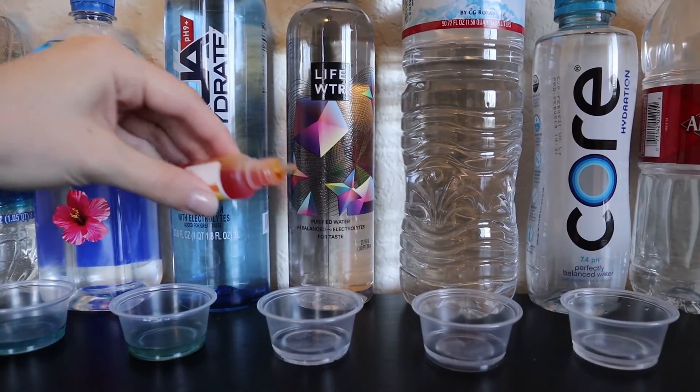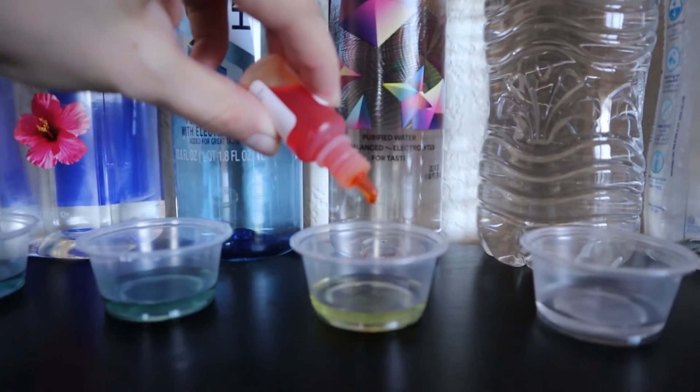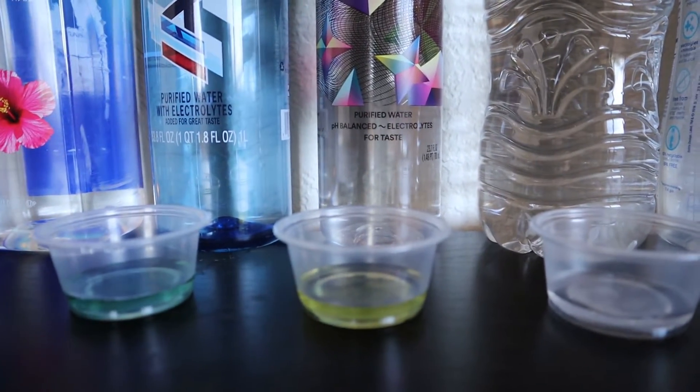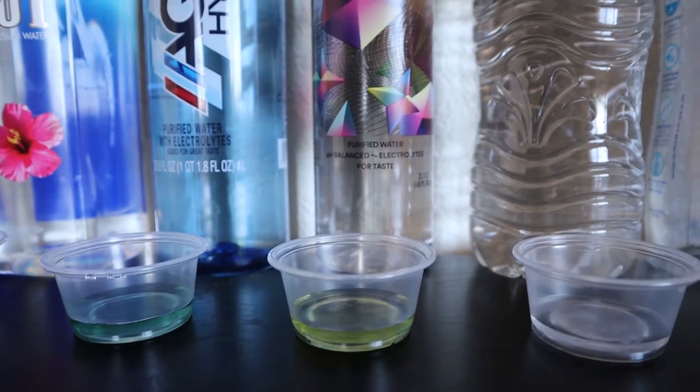Now we'll be testing Life Water. This is also a purified water with electrolytes added for taste. Can you guys taste the difference? Let me know in the comments below. But this looks more on the acidic side as well, so I'm going to give it a 5.5.